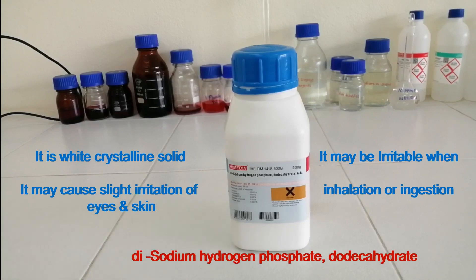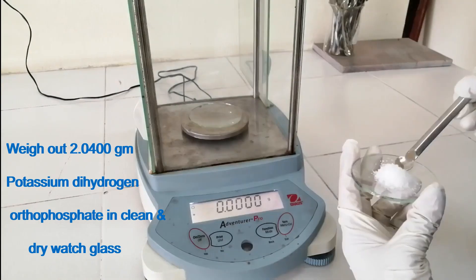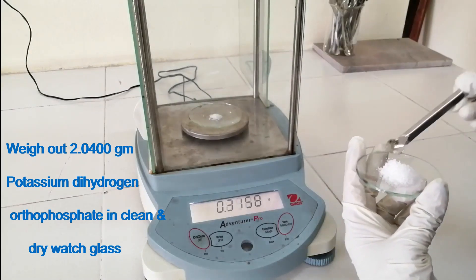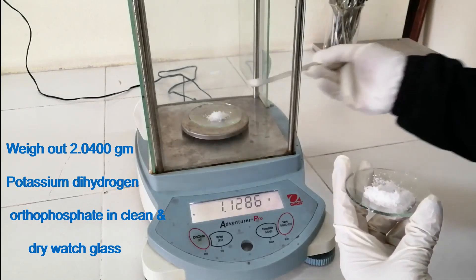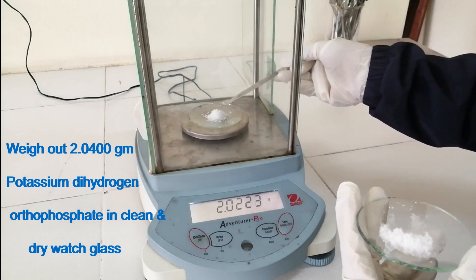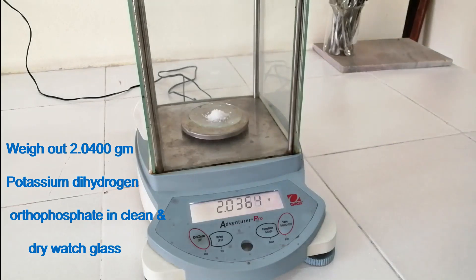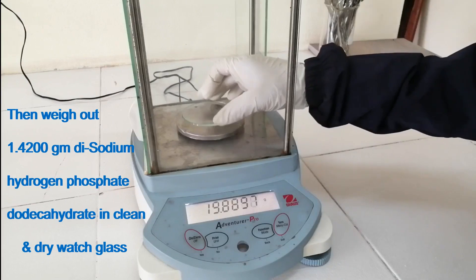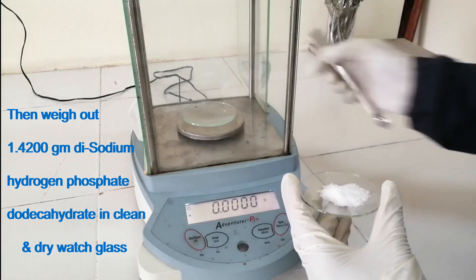Weigh out 2.0400 grams of potassium dihydrogen orthophosphate in a clean and dry watch glass. Then weigh out 1.42 grams of disodium hydrogen phosphate dodecahydrate in a clean and dry watch glass.